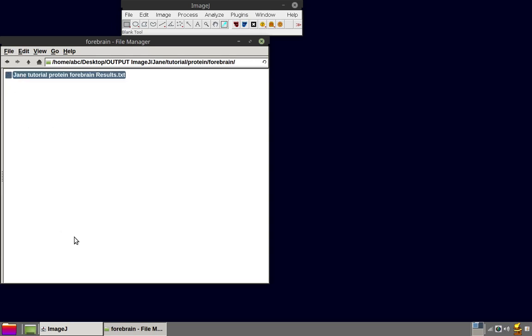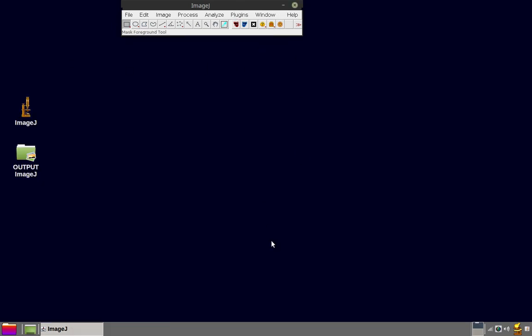A preliminary results spreadsheet with its file name based on the user login is also created. This file is automatically updated with data generated during analyses run by the user signed in. Note that the current user output folder may also be opened with the keyboard shortcut F12.